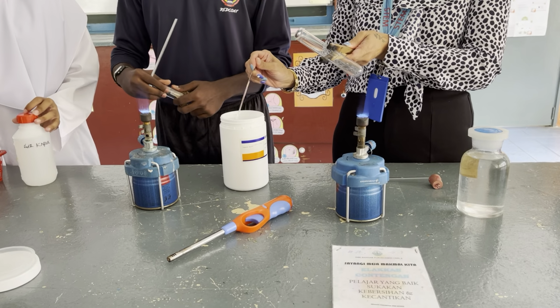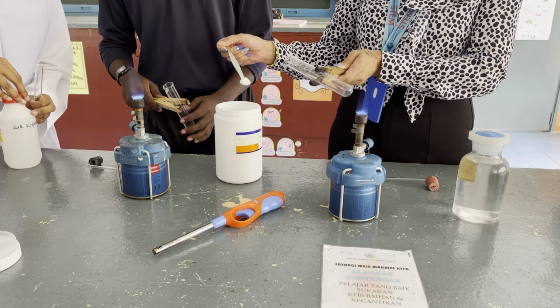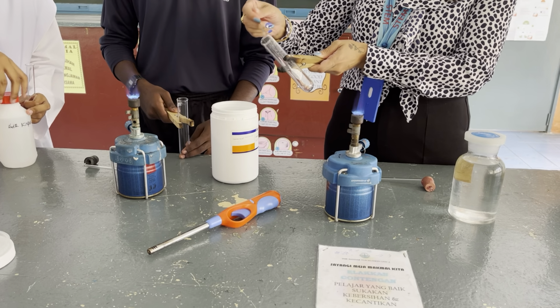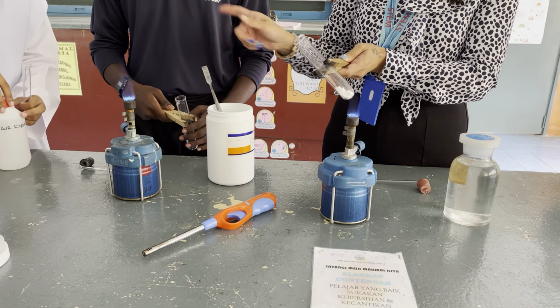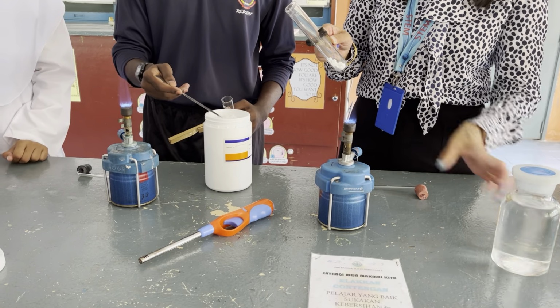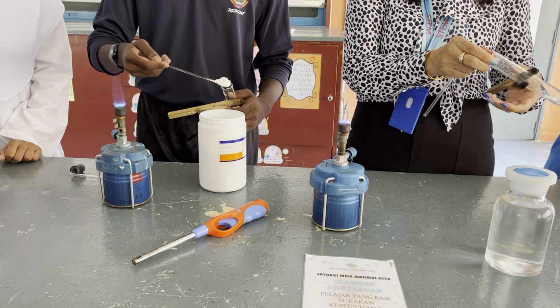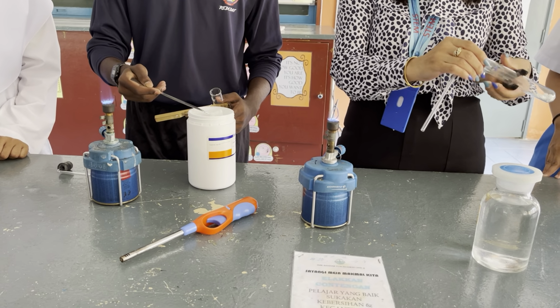1 spatula of calcite or calcium carbonate in the boiling tube. Okay, next, before heating up, we have to close it with the delivery tube into the lime water.